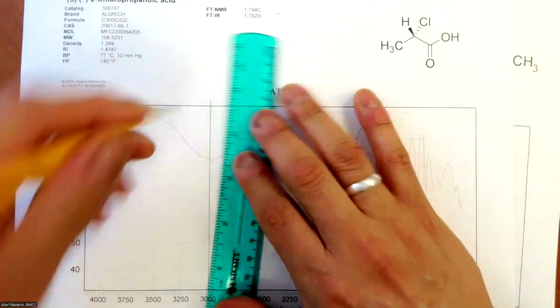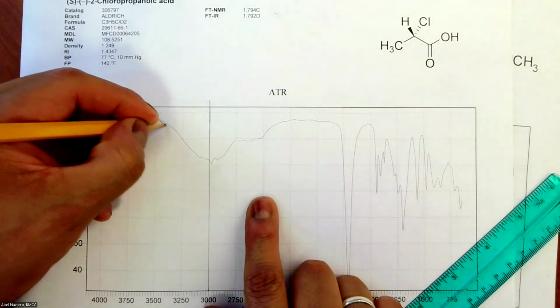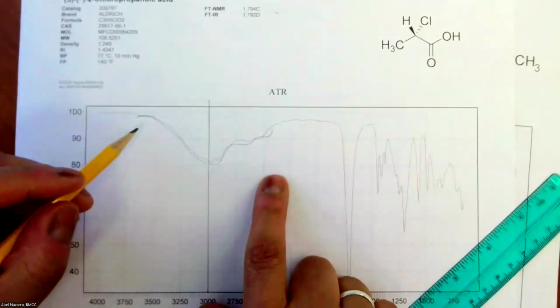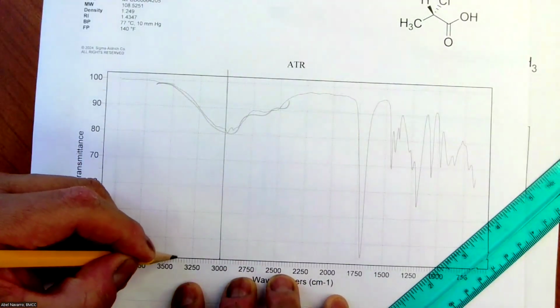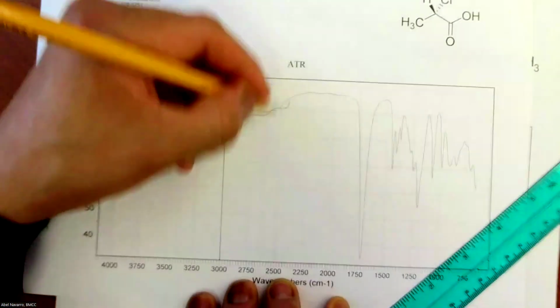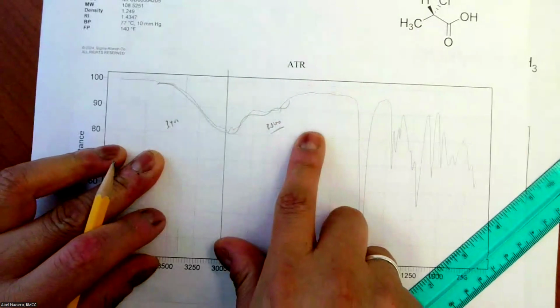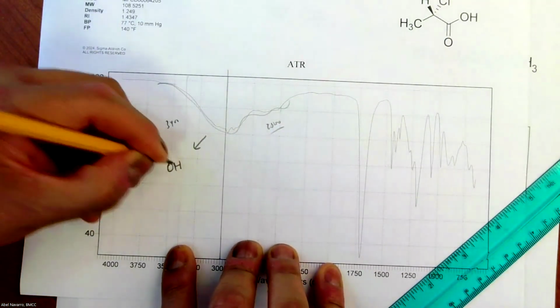Useless in this case. Why? Because you can see clearly the OH peak, broad and round, goes all the way from about 3400 to 2500.